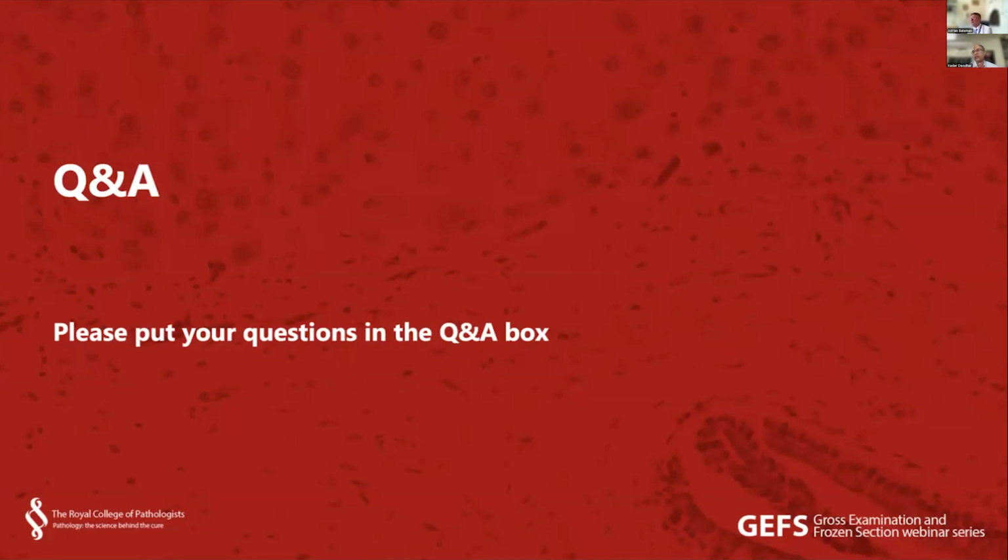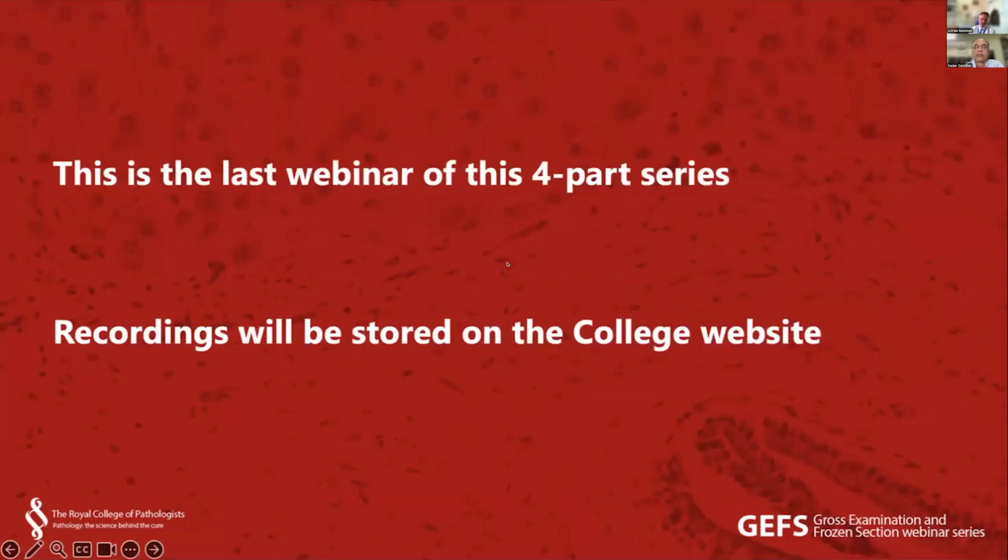Yeah. Good question. Obviously if you only see a tumor nodule and you don't see any tumor-involved lymph nodes that you're sure are nodes, you'd call that pN1C. I would personally just count for the N1A, 1B, 2A, 2B categories tumor foci that I was convinced were in lymph nodes, but then I would make a note of the number of tumor deposits separately.